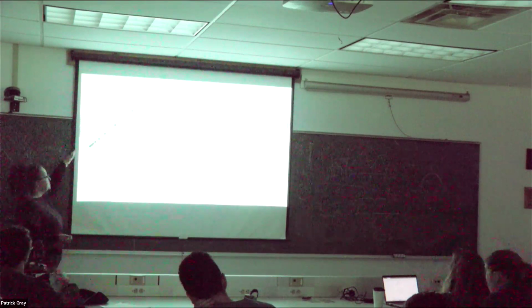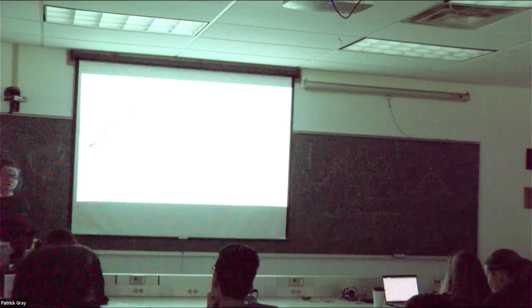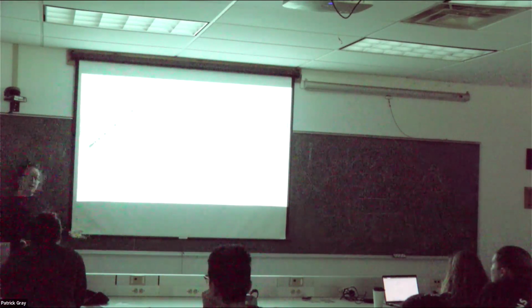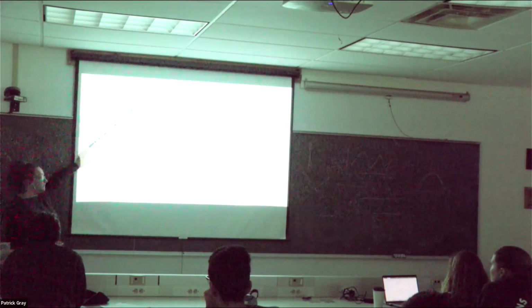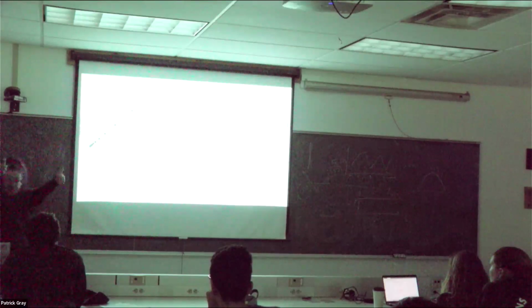So you can have your instrument and you can have extracted chlorophyll, you get it online, spin it, you dissolve it in acetone, you make a serial dilution, and boom. You have a factor that allows you to measure fluorescence at one wavelength and calculate the concentration of extracted chlorophyll on the other side. Fabulous, no? We're good.